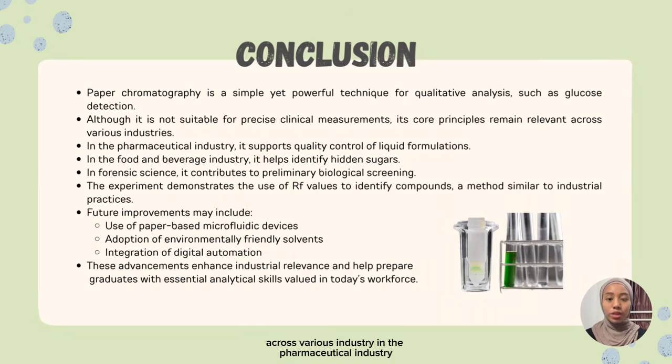In the pharmaceutical industry, it supports quality control of liquid formulations. In the food and beverage industry, it helps identify hidden sugar. In forensic science, it contributes to preliminary biological screening. The experiment demonstrates the use of RF value to identify compounds, in a method similar to industrial practice.